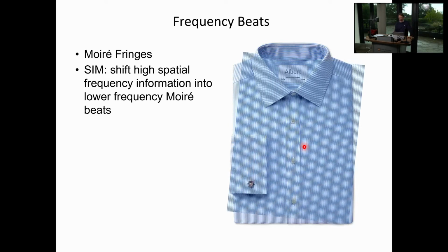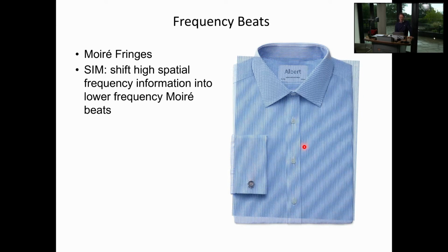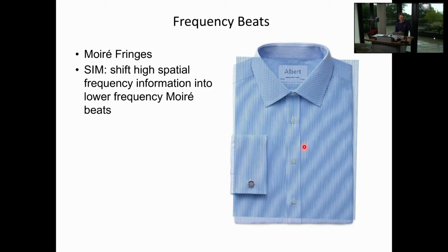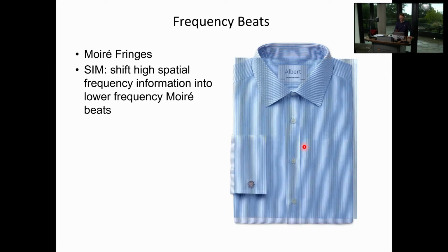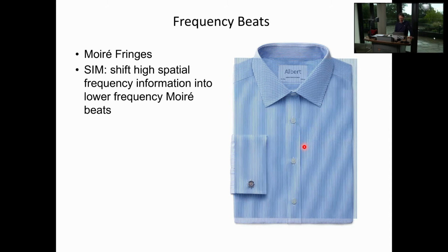And so the idea is then I somehow generate these frequency patterns, I understand what the beat patterns are, understand the physics of it, and then I go back and use the computer to calculate from the beat patterns what the underlying sample patterns were.